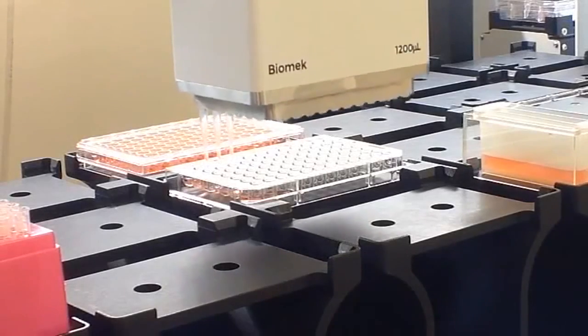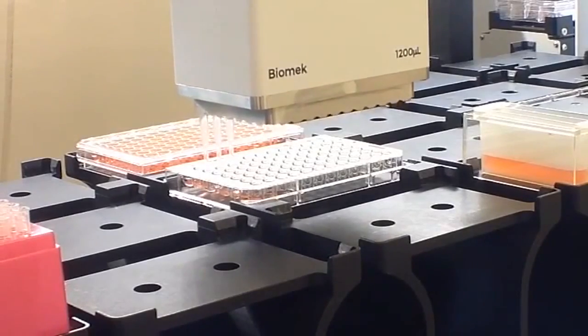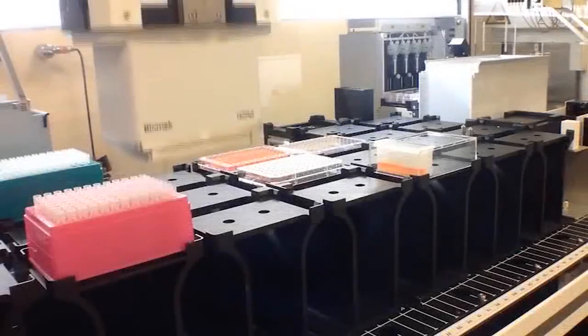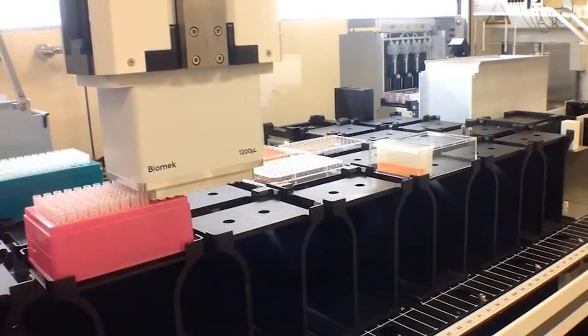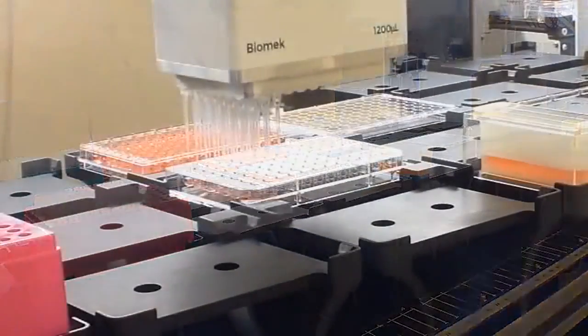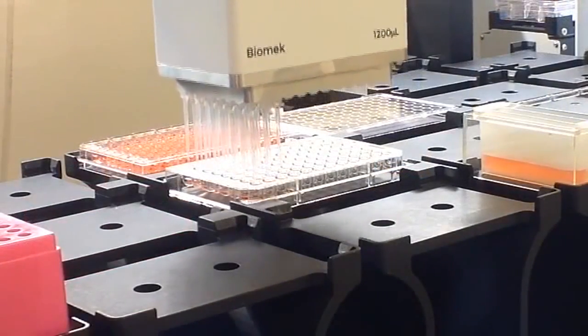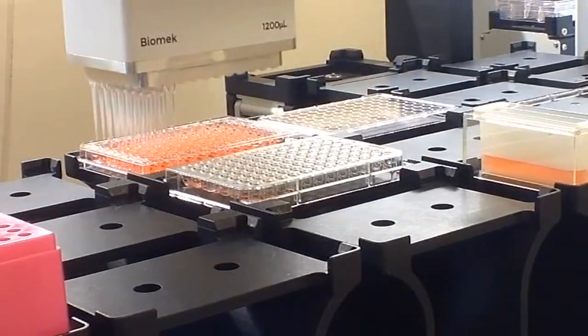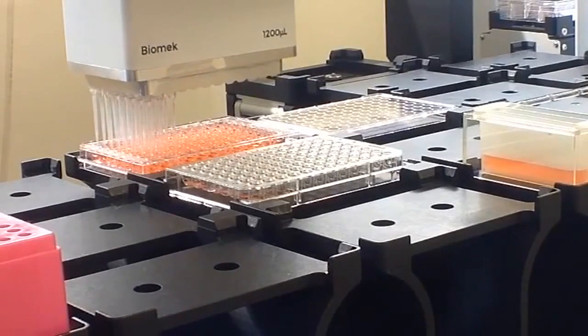Once the serial dilution is complete, as mentioned, we will have 24 total wells, 8 different concentrations of 3 compounds. We then load 24 tips using the selective tip feature on the multi-channel head, and these compounds will then be stamped into the cell plate shown in the position behind it. By doing this repeated stamping, not only are we able to do dose-response curves, but we're also able to establish a time course of treatment by just processing partial plates.